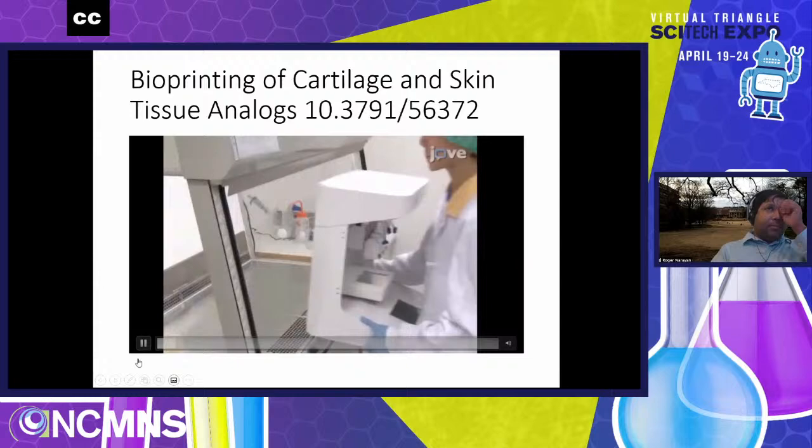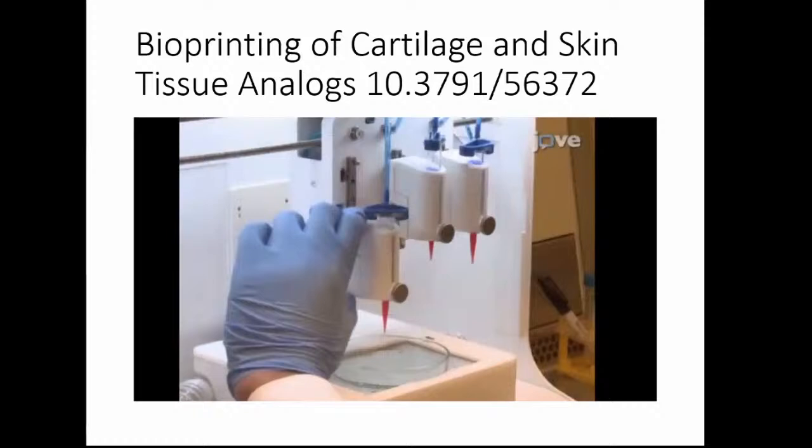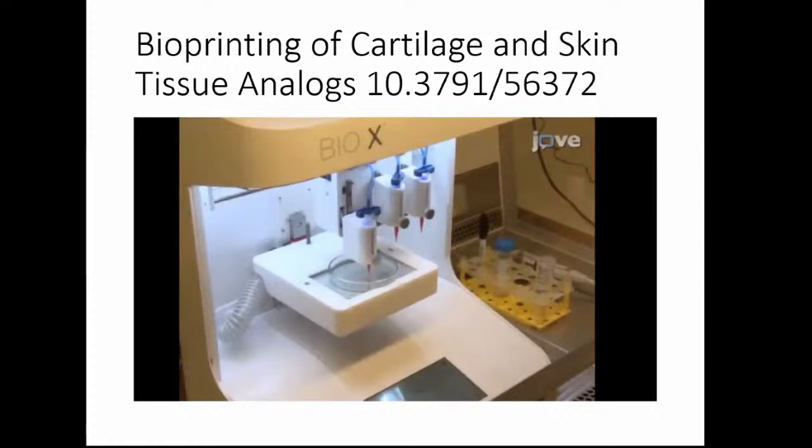Maintain sterility by placing the bioprinter in a laminar flow cabinet. Then, attach sterile printing nozzles to the cartridges containing the bioink cell suspension blends and insert them into the bioprinter. After calibrating the bioprinter, bioprint the lattice-structured cell-laden constructs using the 25-gauge conical nozzle at a pressure of 25 kilopascals. Bioprint cell-free constructs as a control.